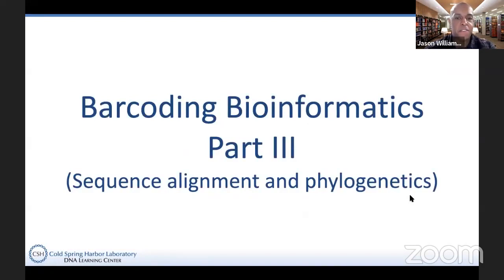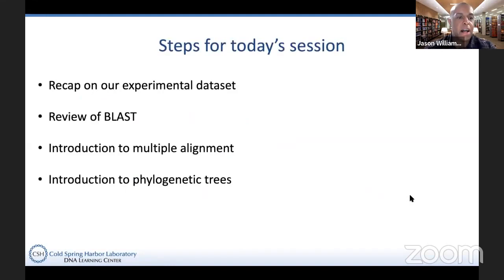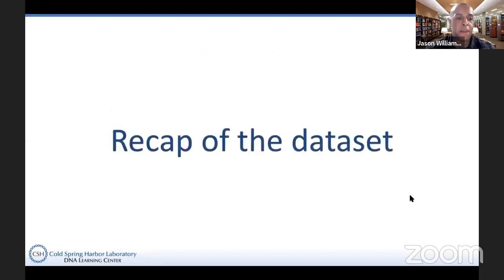Okay, so today we're going to focus on sequence alignments and phylogenetics. Let's recap our experimental data set and review what we covered last time from BLAST. And then we're also going to introduce two new topics. These are pretty extensive topics, not the easiest, but we will at least provide an introduction, and downloading some of the packets that we posted gives you even more in-depth explanation and prepares you for that.